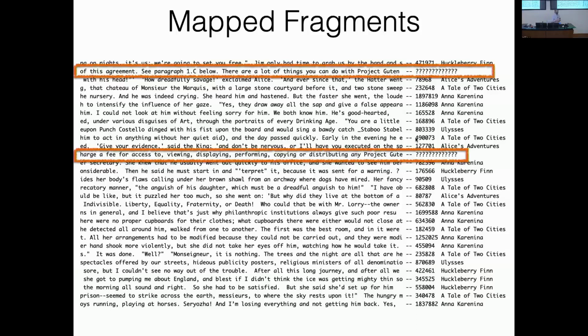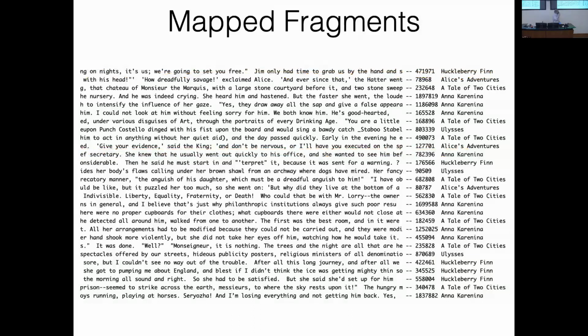And I don't really care about it because it's not biological, it's not book data. So I'm just going to throw it out. And as long as you don't have too much of it, that's generally what you're going to do for real biological data too. And so we're just going to kick that out. And now we have only book data.